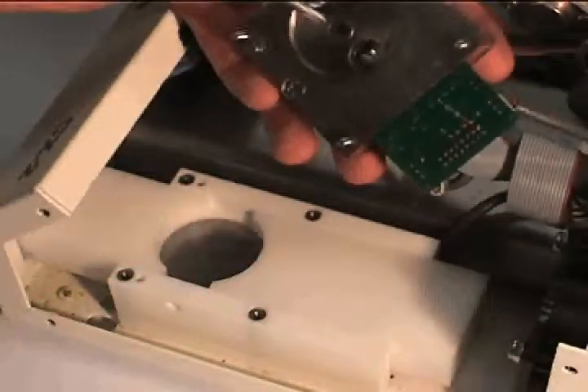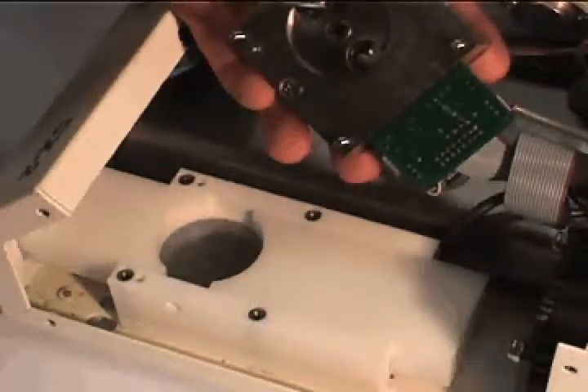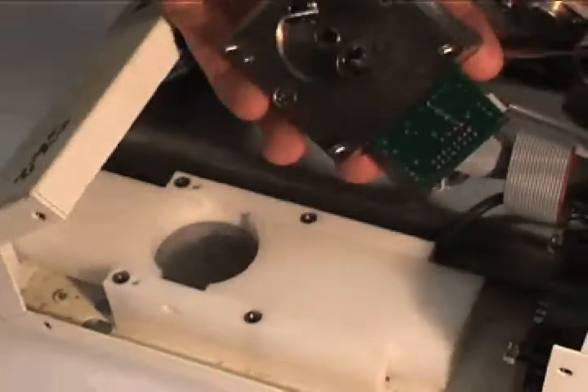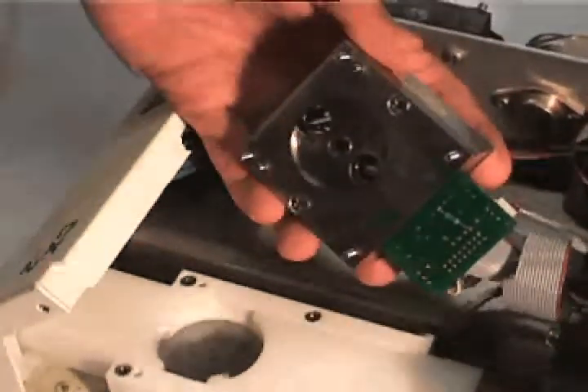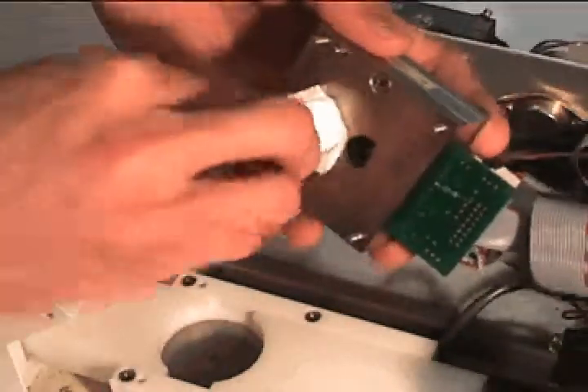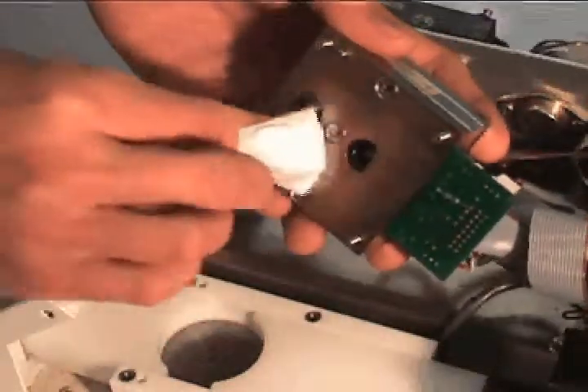The next area you will need to clean is the infrared sensor on the underside. The infrared sensor is the black lens surrounded by the chrome ring. It is important to have this sensor lens cleaned from all dirt, smudges, and lint.